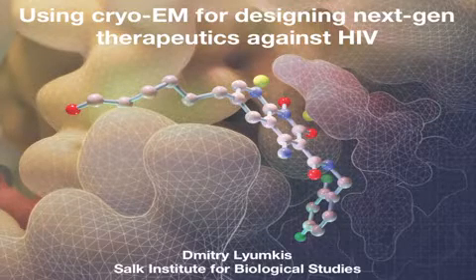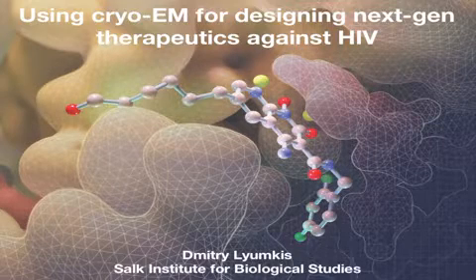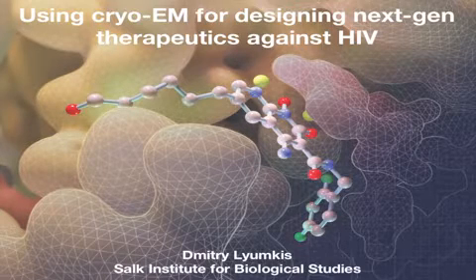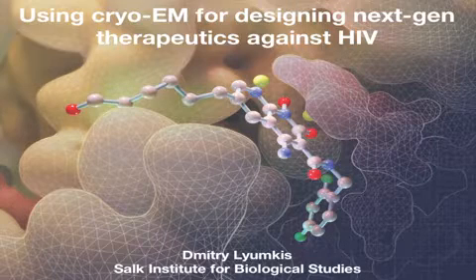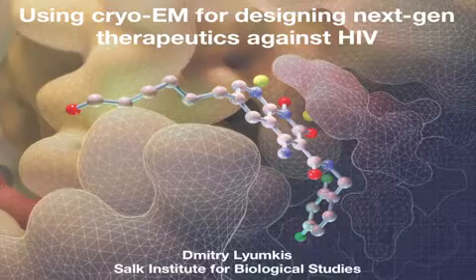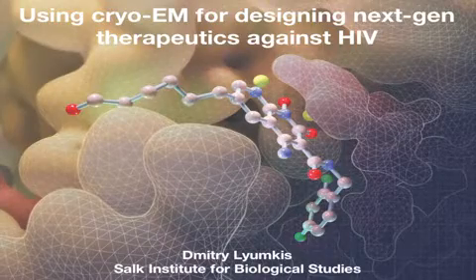So with some of the continuous developments in cryo-EM, more recently what we realized is that we can now utilize advanced imaging and image processing strategies to understand how small molecules bind to these nucleoprotein assemblies that catalyze integration, and really to utilize the workflows for structure-based drug design. So I'm extremely excited to share this story with you today.